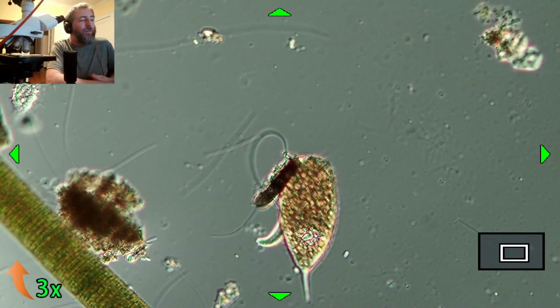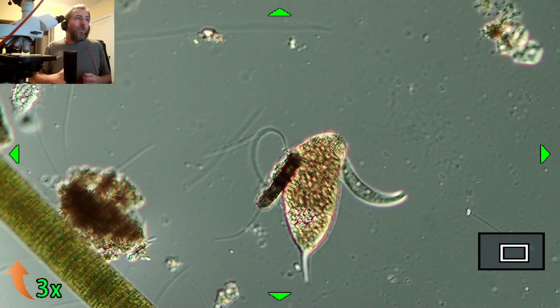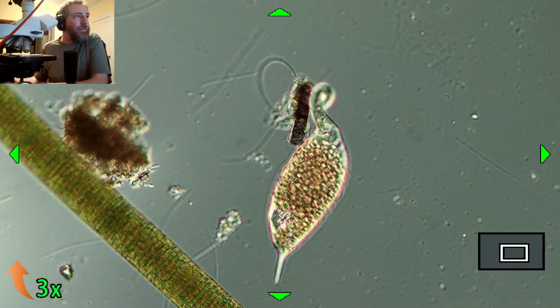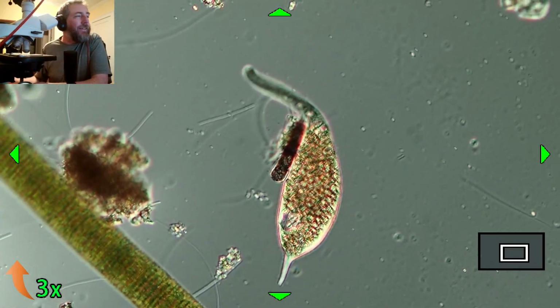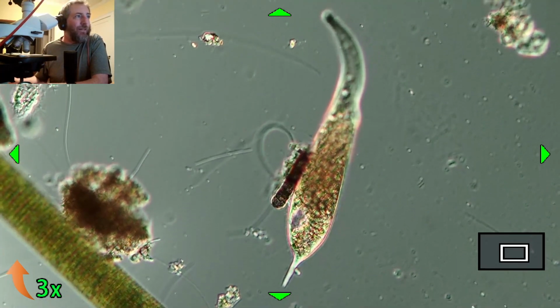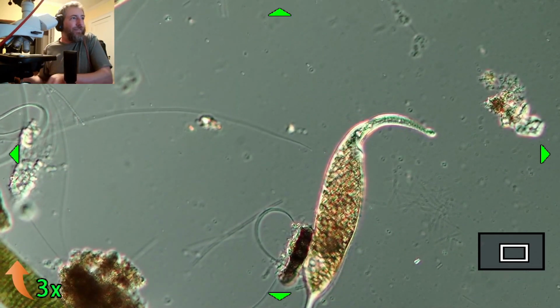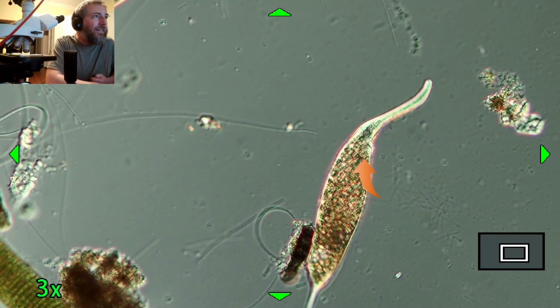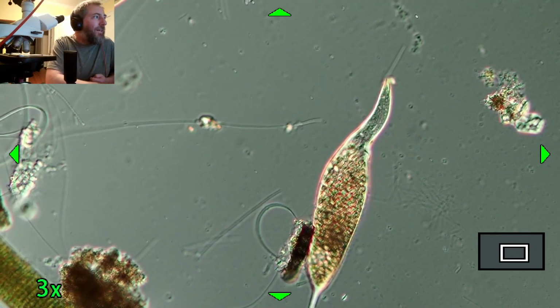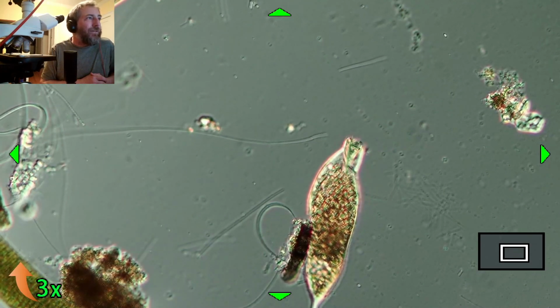Until it eats, you won't really have a complete understanding of it, but it kind of folds open like an envelope at the top and just consumes whatever gets close. And there it is. You can see the mouth right there. They also have little stingers that shoot out and grab prey and pull them right into their mouth. So if it wasn't frightening enough, you can see the mouth fold is right here. It'll expand that out, and then stuff will just zoom in there as it pulls them in. It'll look like a tractor beam basically pulled it into its mouth.